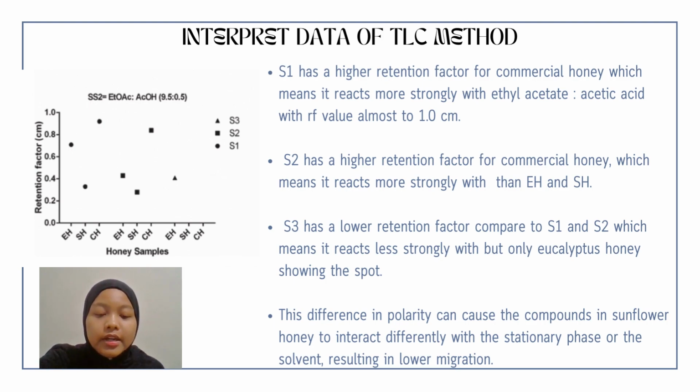So by comparing between the two graphs, the highest value of retention factor for identifying various compounds goes to commercial honey, which is high.